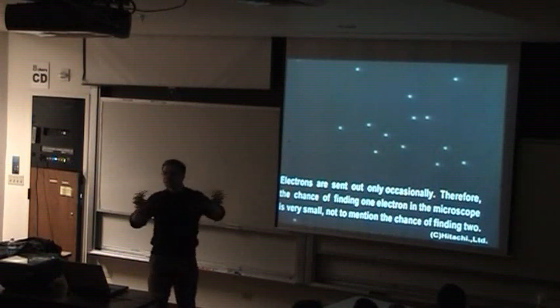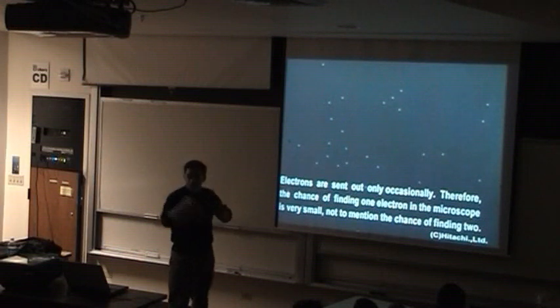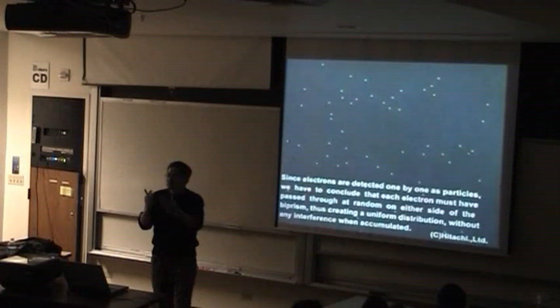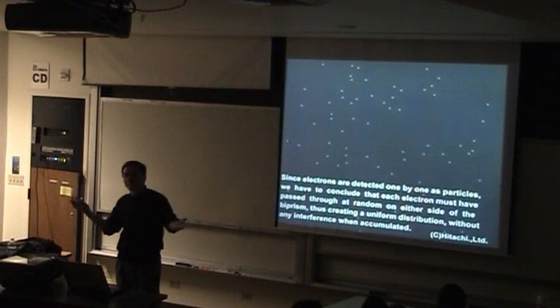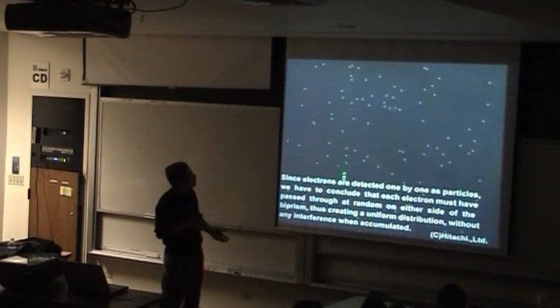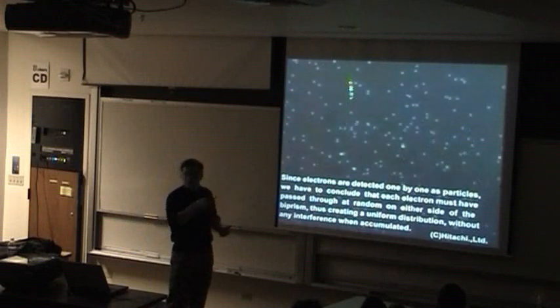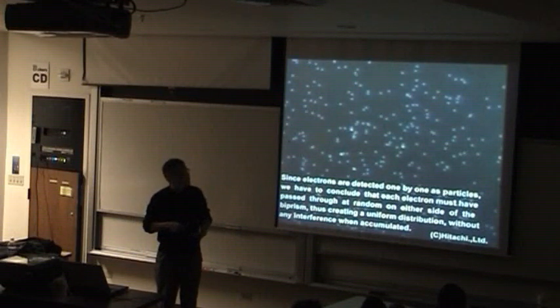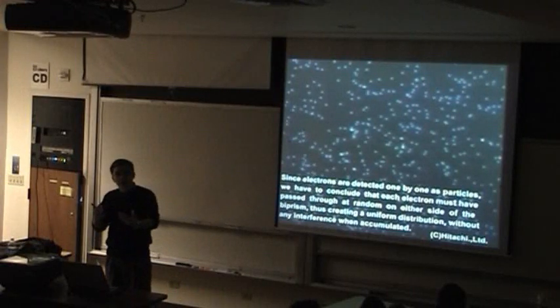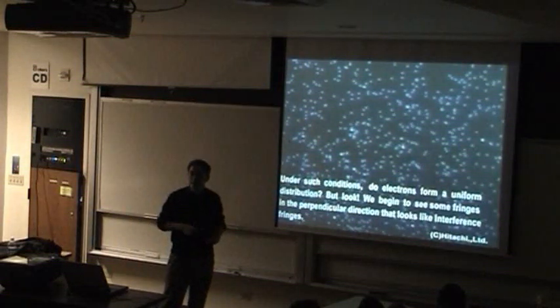So the electrons at the beginning are just random. If you look at 100 electrons, you shine 100 times, the pattern will be completely different. So with 100 electrons, there's no phase. Phase doesn't make sense, right? Later you will see, as the number of electrons gets larger, you get a statistical effect. Then you will see some interference effect. And that interference effect, we call it coherent diffraction, or speckle diffraction. That can help us find the phase information.